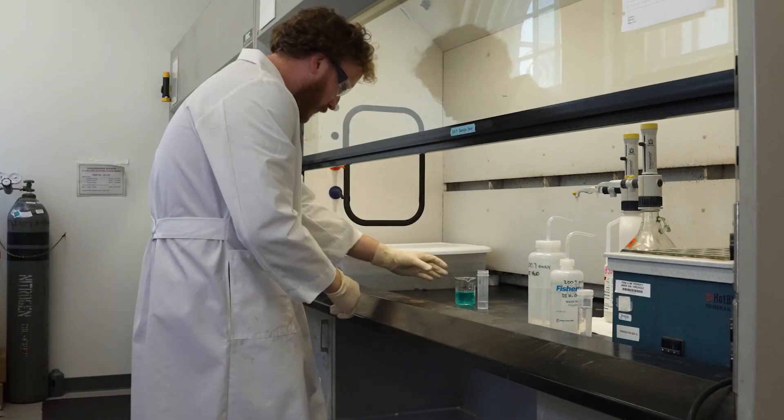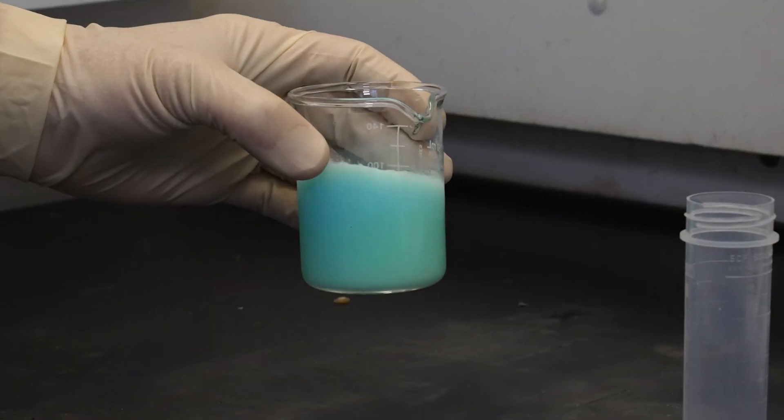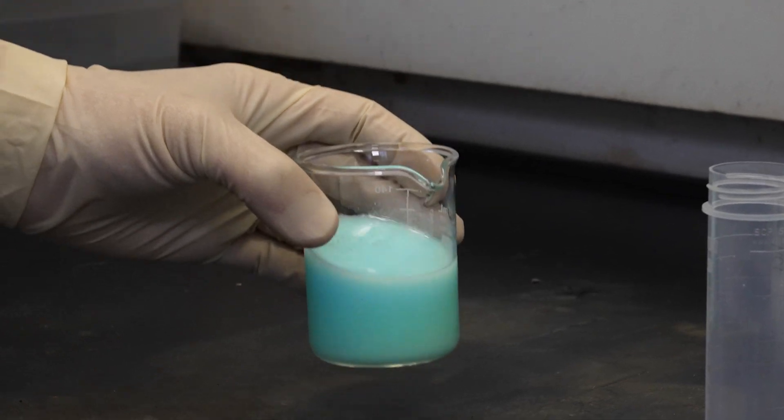We're a fully accredited, state-of-the-art laboratory that provides the Navy with accurate and timely materials testing and technical expertise.